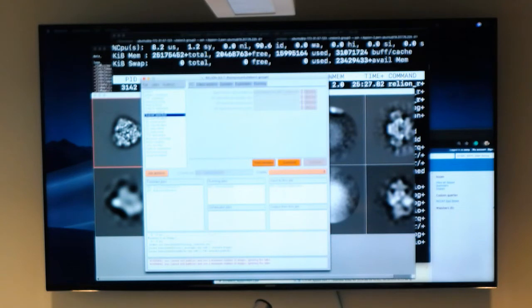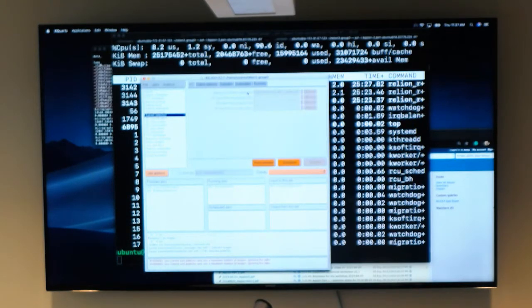Something that may happen is that your particle picking object selection is not very good. You may have duplicates. So something that's also useful is that with a subset selection, you can specifically say, I want to remove particles that are too close together.